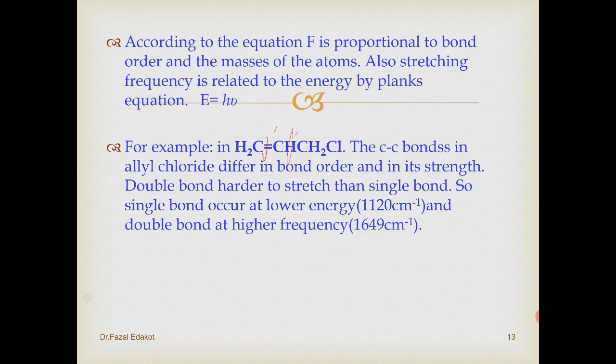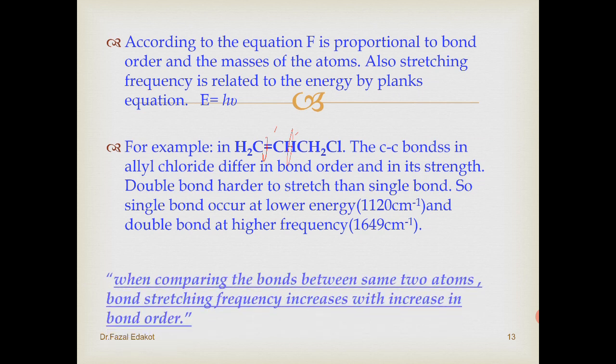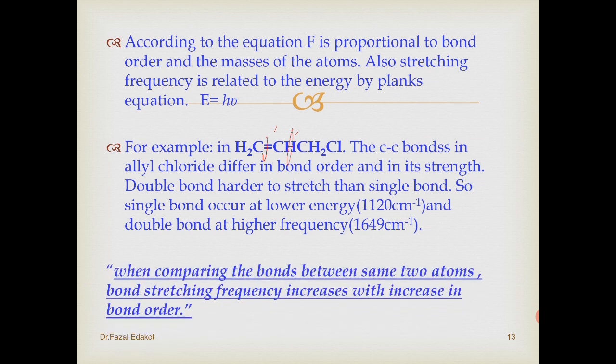So you got the idea. A single bond is weaker, so lower energy. A double bond is stronger, so higher energy. The take-home message is: when comparing bonds between the same two atoms, bond stretching frequency increases with increasing bond order, as you have seen in the example.